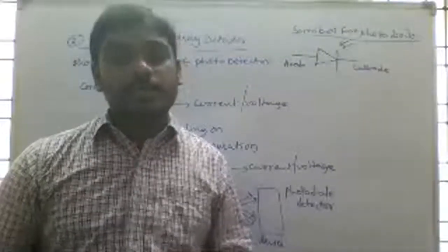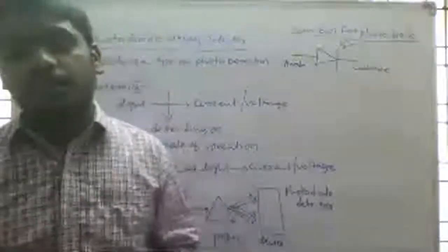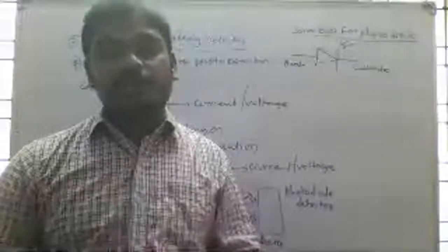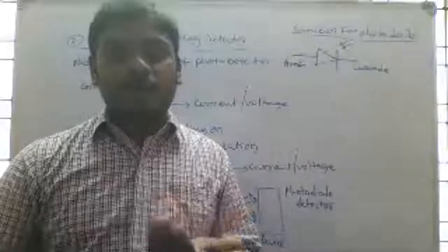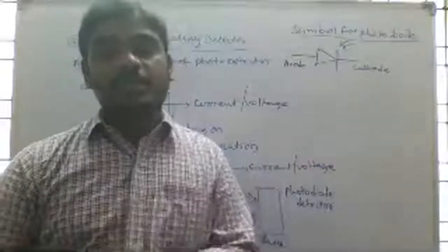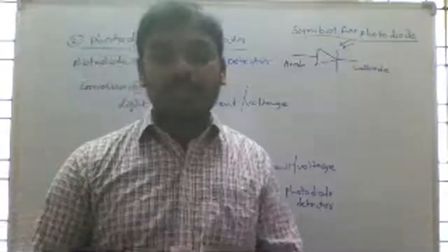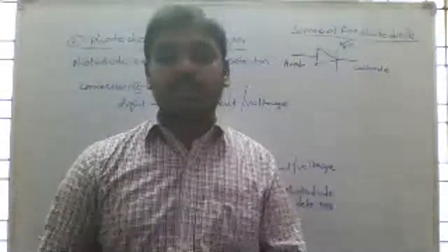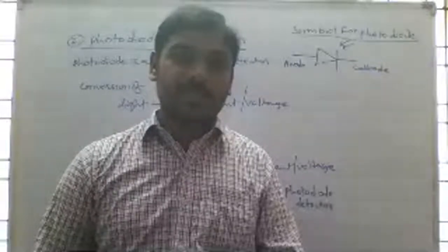Photodiodes are similar to regular semiconductor diodes, except that they may be either exposed or packaged with a window or optical fiber, to allow the light to reach the sensitive part of the device. Many diode devices designed specially as photodiodes use a PIN junction rather than a PN junction.